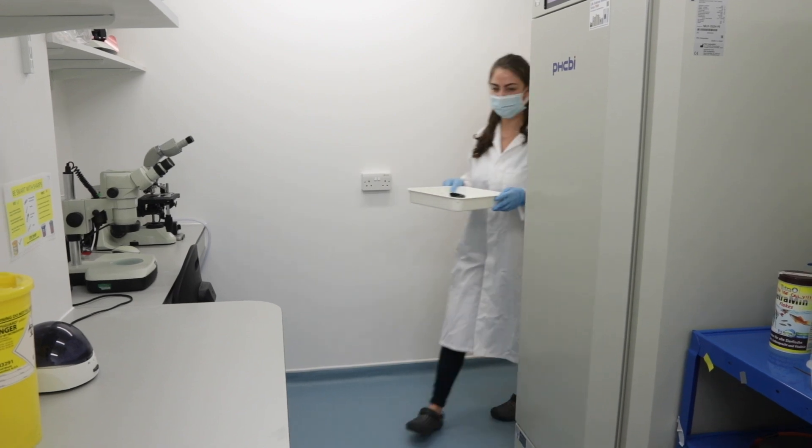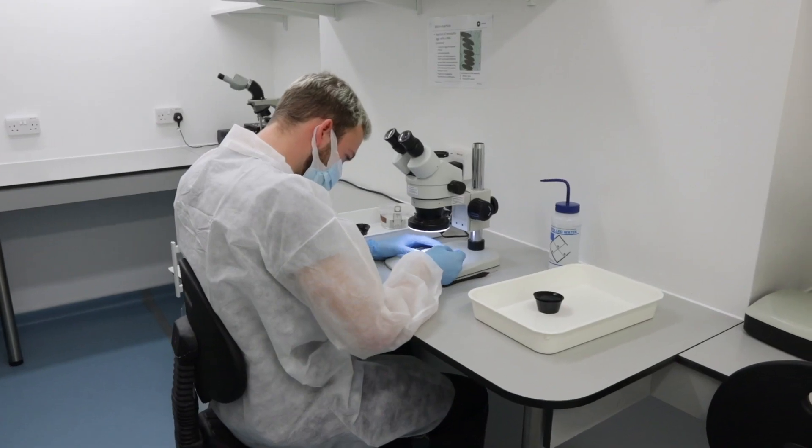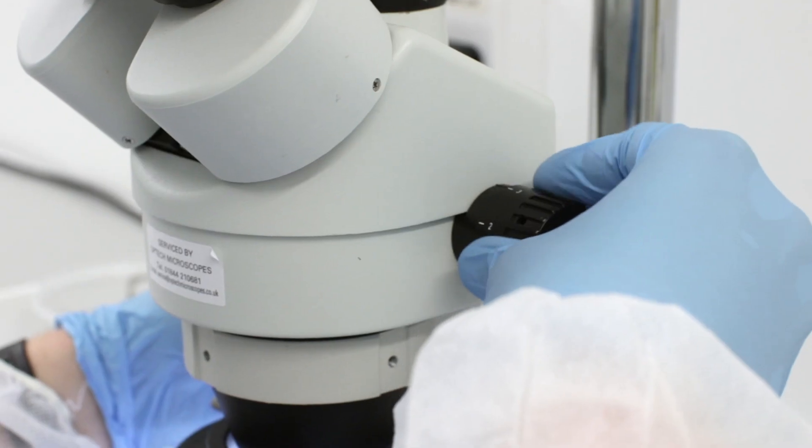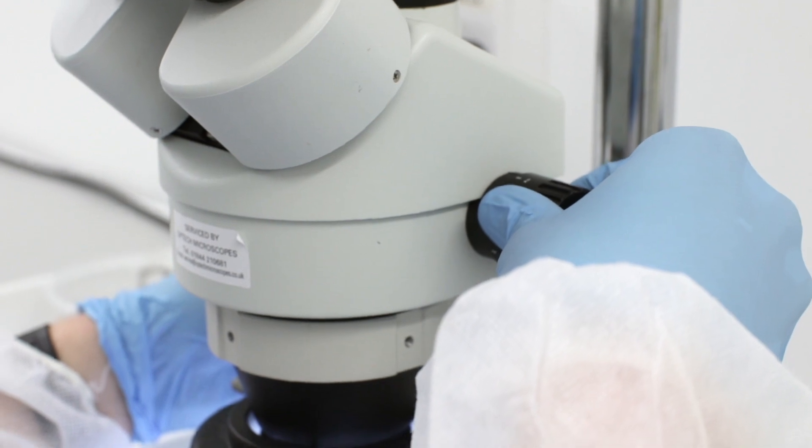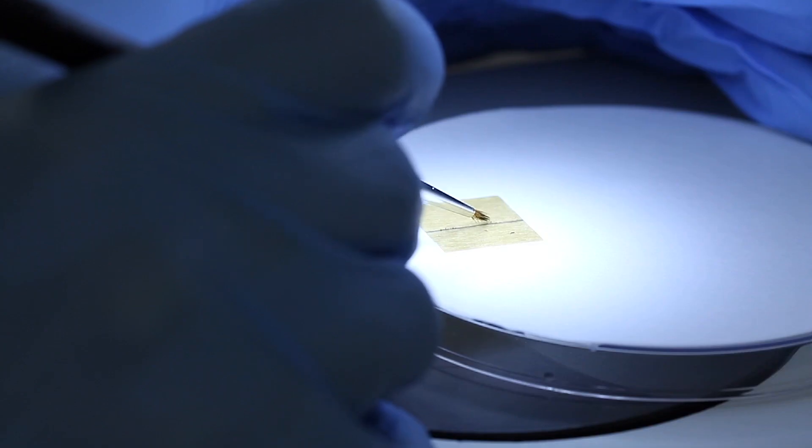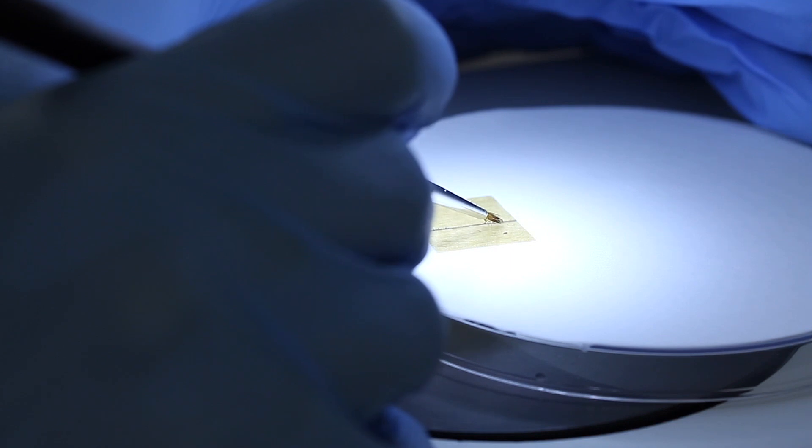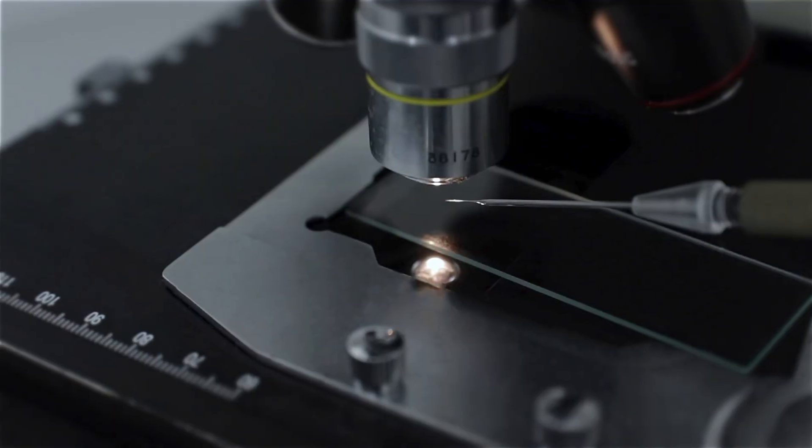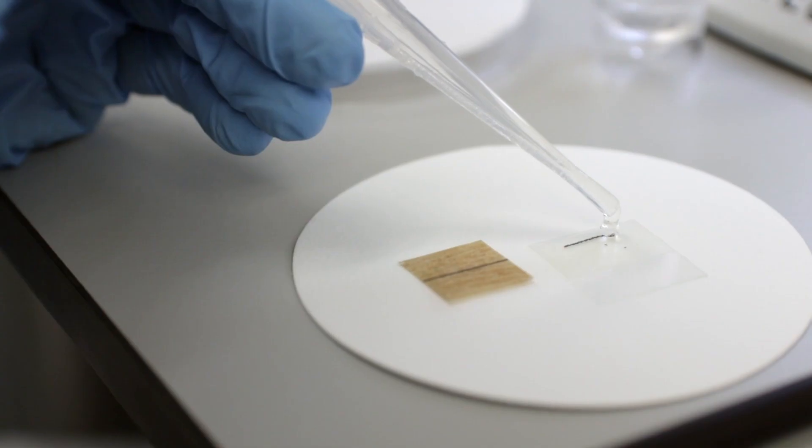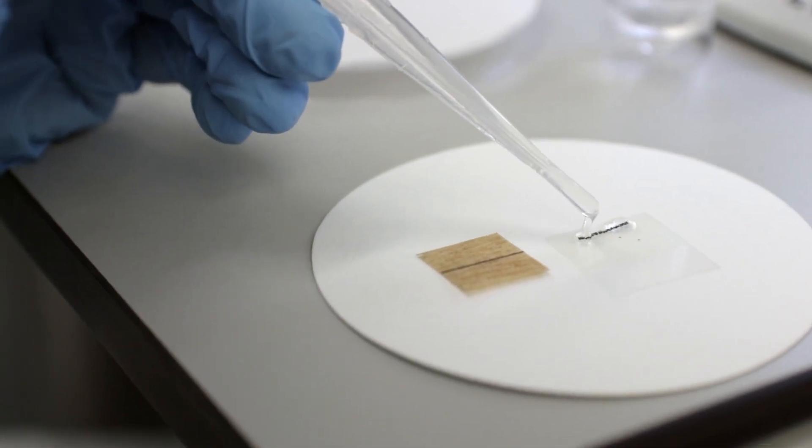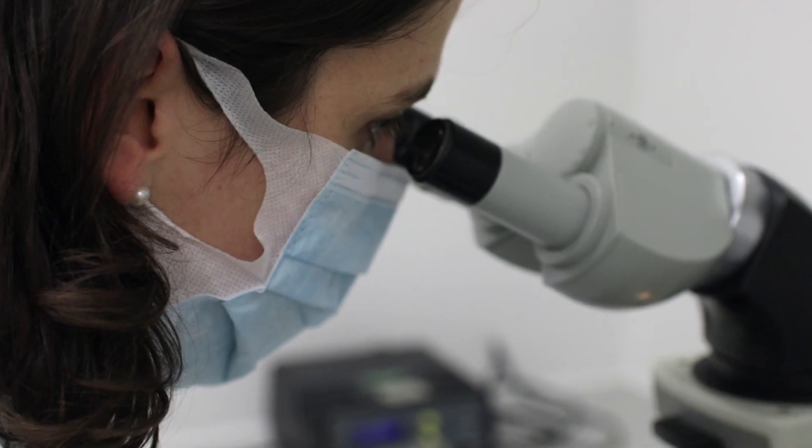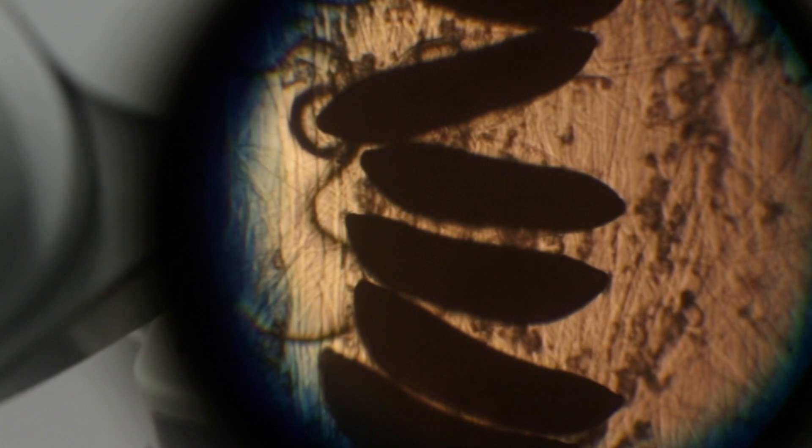We take eggs which are less than an hour old and bring them to our next stop, the injection lab. This is where we take the DNA that contains our self-limiting and fluorescent marker genes and inject it into the eggs. Our scientists line up the eggs on the paper that will go under the microscope, ready for the injections. We make the microneedles that are necessary to inject the tiny eggs, add the DNA mix to the needle, and use this injection machine to apply pressure and put a tiny bubble of DNA mix into each egg until every single egg is injected.